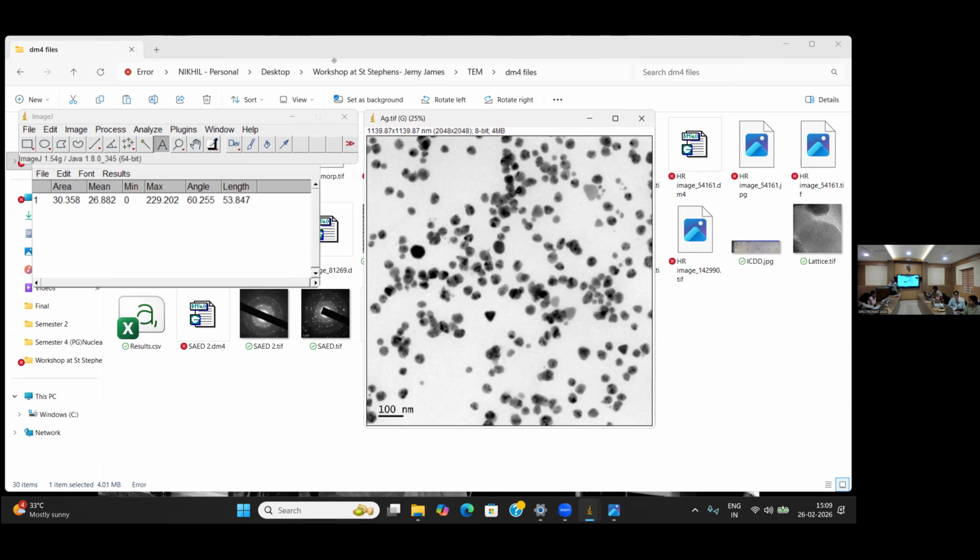So the same method we can follow for SAED pattern indexing. In SAED patterns, we can see the spots. Here you can see the diagonal spots. With this, we just measure from here to here. For every ring, we take the diameter. The easiest way is in Digital Micrograph, the other software that we use for microscopes. The specialty of a circle is that there is only one diameter. If we choose one point and measure the other side, in one point we will have the maximum value. That is the diameter.